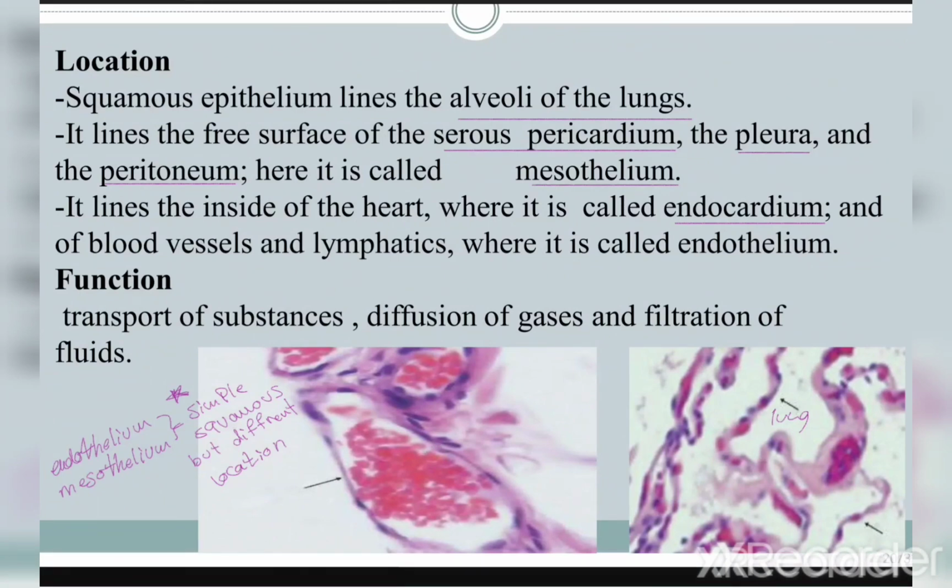And this is a lining of a blood vessel, lined by endothelial cells, the simple squamous epithelial cells, the flat cells that line the wall of the vessels. Endothelium.